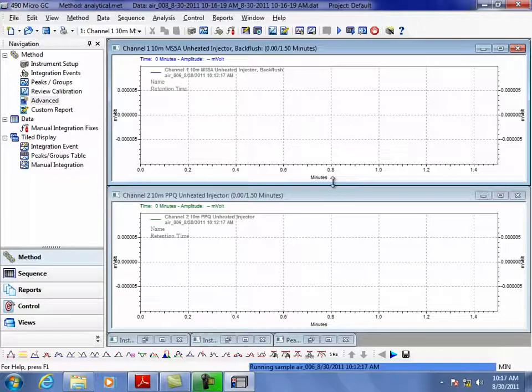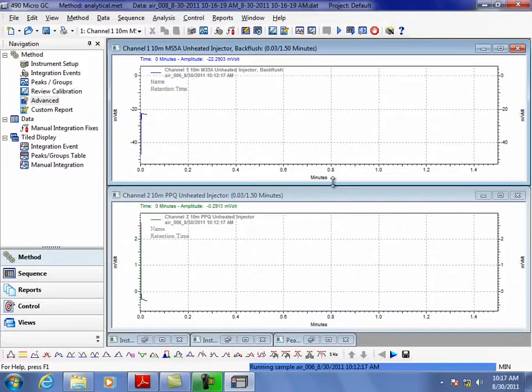That's right. The only way that we would know is running an external standard. And in this case, air. We know that there's CO2 in air. We know there's some other things too, we just can't see them because they're below our detection limit. Like there's a little bit of neon in there, and sometimes you can see neon, which also comes around where hydrogen and helium do. But it's very, very small, and it never affects the amount.